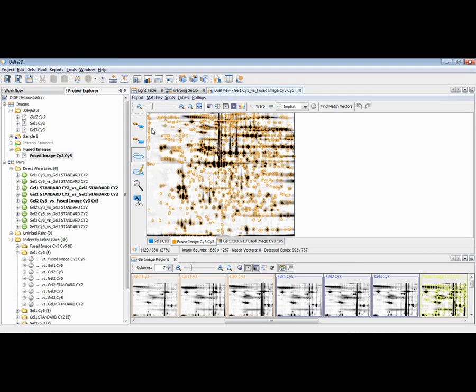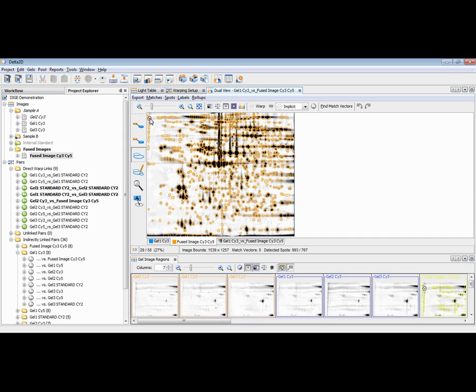front at the left and the right. This is where the IPG strip is ending, and also on the bottom this is where the gel is ending, and of course you image them because you want to see the whole image in the software. I can easily delete or cancel these spots. For example, I can just click them and press the delete key.